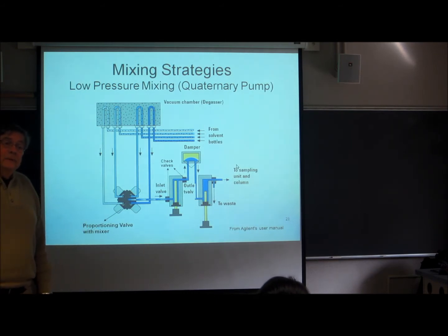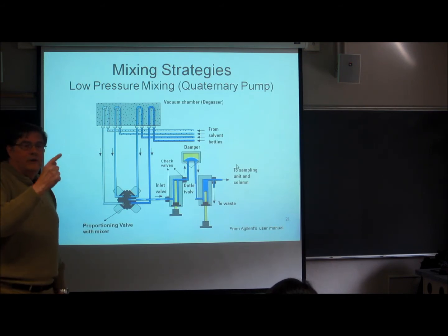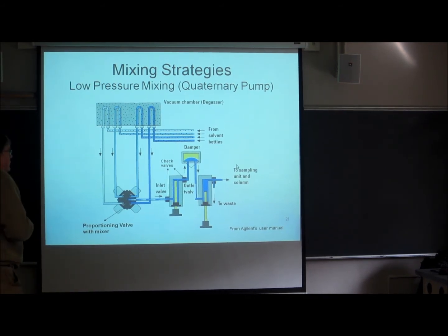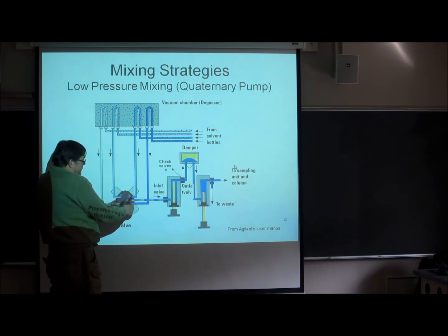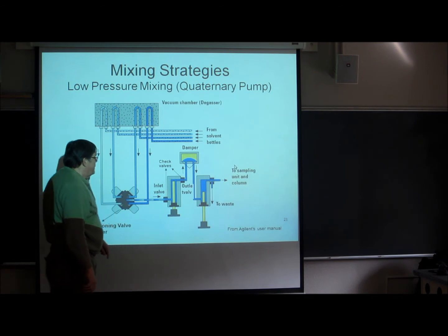Those bubbles are bad. I don't think I showed you in the check valve, but bubbles in a check valve will make them stutter, and that produces a change in the flow and interferes. Bringing in solvents that will provide different solubilities for gas, and that's what this evacuator is about. Low pressure with a vacuum, and then selecting the right mixture from the valve, and then pressing it outward.